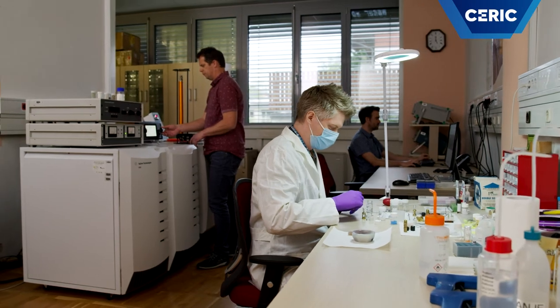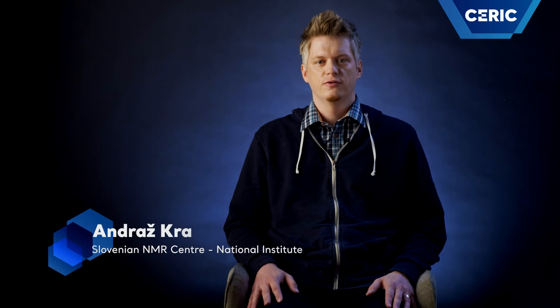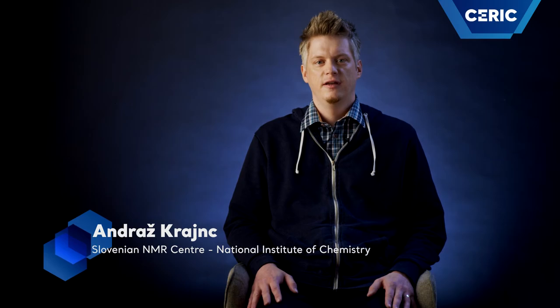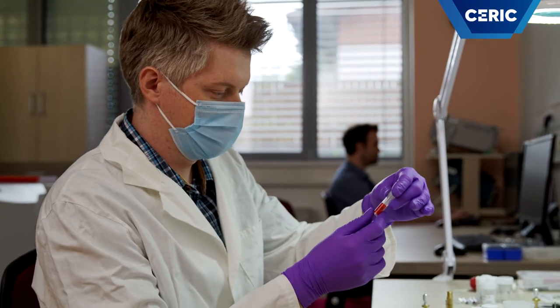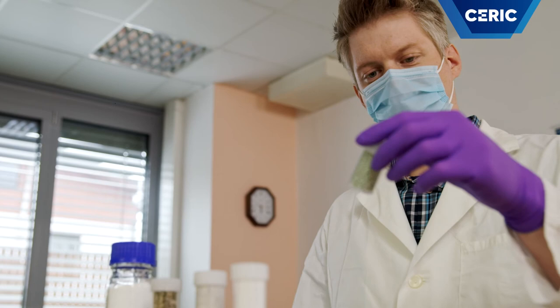My colleague, Dr. Andraž Krajnc, will show you what kind of samples we investigate in our lab and how we prepare these samples for the NMR measurements. Most of our research is focused on microporous materials, more precisely on zeolites and metal organic framework materials. These materials are very important in catalysis, in gas separation and storage, in energy storage and in some other fields. We also study battery-related materials, pharmaceuticals, polymers and more. Basically, we can study any material that contains NMR-sensitive nuclei in sufficiently high concentration.